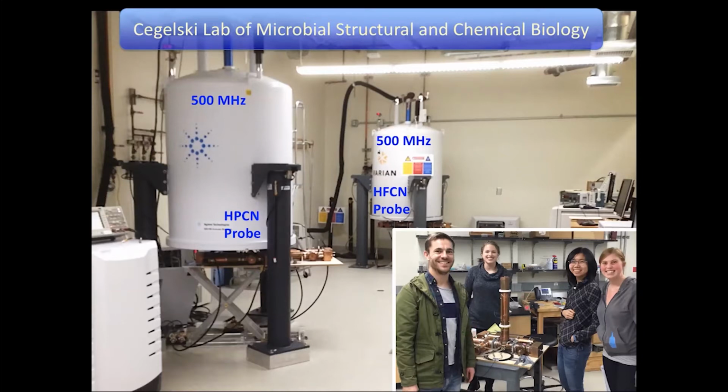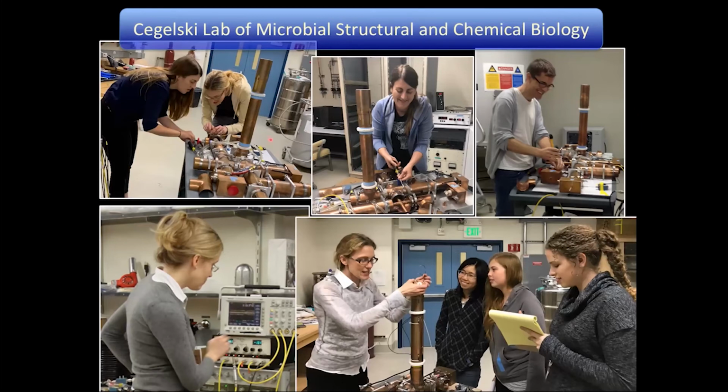And this was one group of students where they learn now how to modify or sometimes repair parts of the probes. And here's some of those pictures in action. You could tell this is all pre-COVID, no masks, everyone's smiling. And this was up here at the top of the probe. Of course, that's the part that goes up into the magnet.